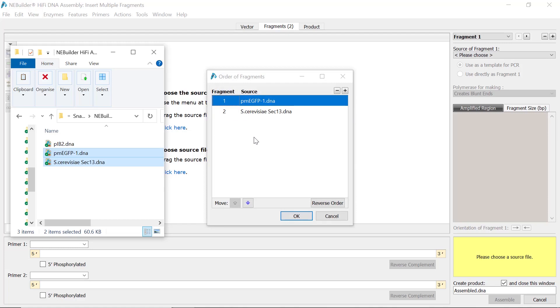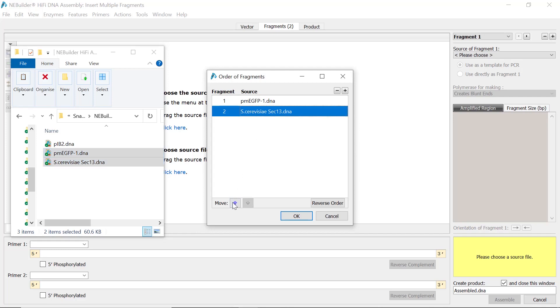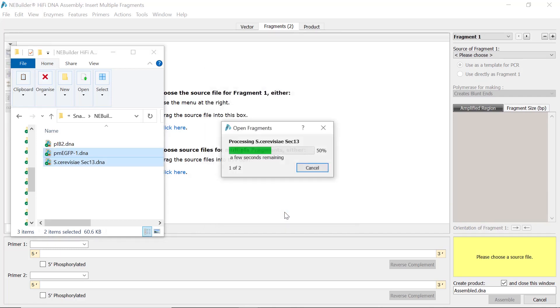When more than one fragment files are loaded, SnapGene will ask you what order they should go in. To adjust the order, you can simply use the up and down arrows.